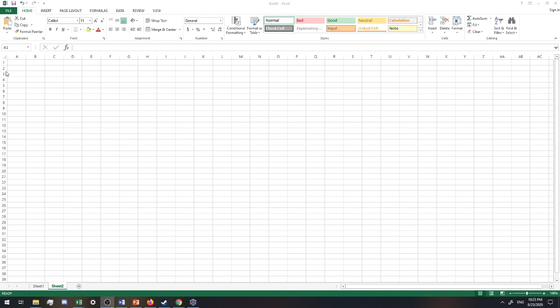So in this week's lab, you're going to make a measurement, well, two measurements. Those two measurements are going to be related to temperature. So you're going to have some expected temperatures, and then you're going to have some actual temperatures that you measure. So I'm going to create some labels.